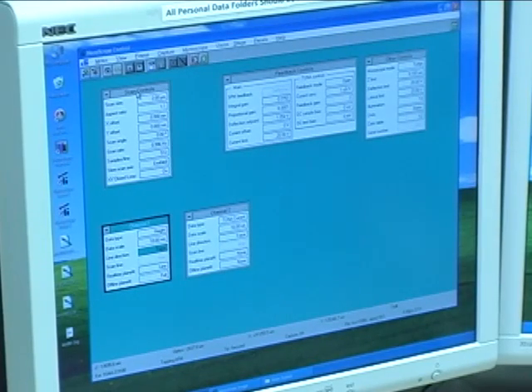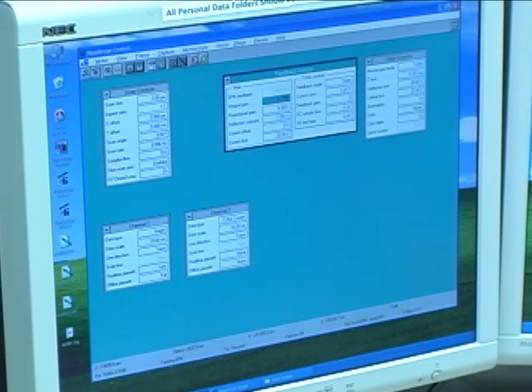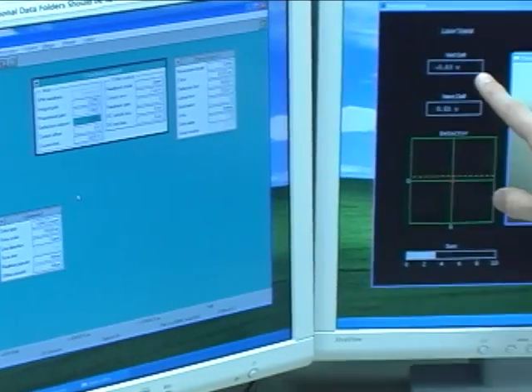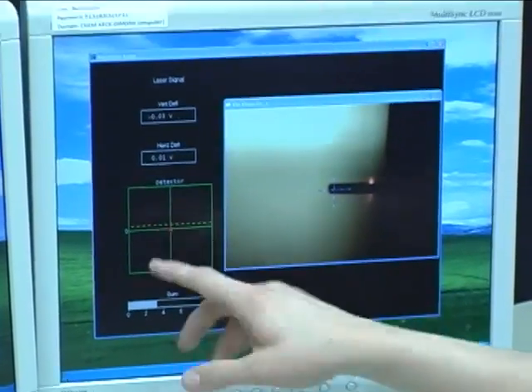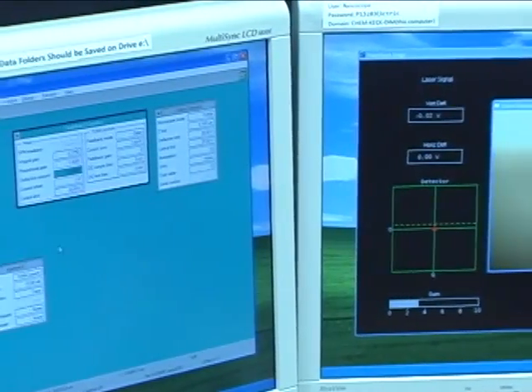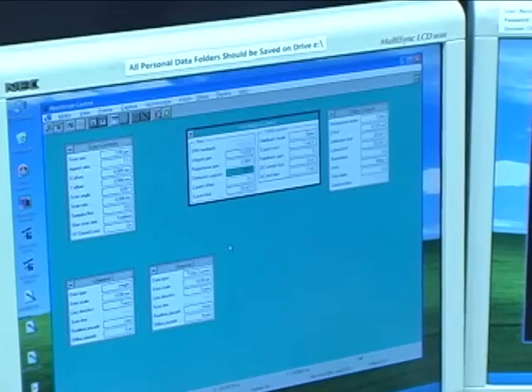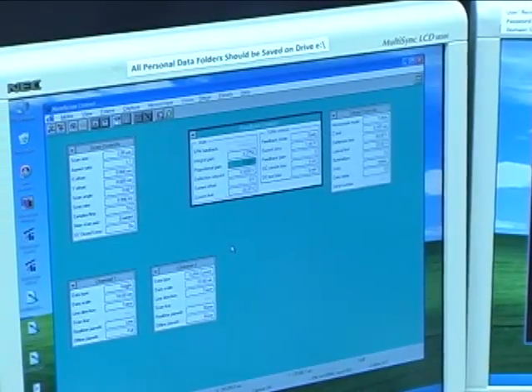So the important settings are that you are in the tuna mode, that the z-limit is set at its maximum value. We'll pick a deflection set point that is somewhat larger than the vertical deflection of our tip as it's zeroed out here. So in this case, our vertical deflection on the tip is minus 0.02 volts. So as a starting deflection set point, I'll select positive 0.3 volts.